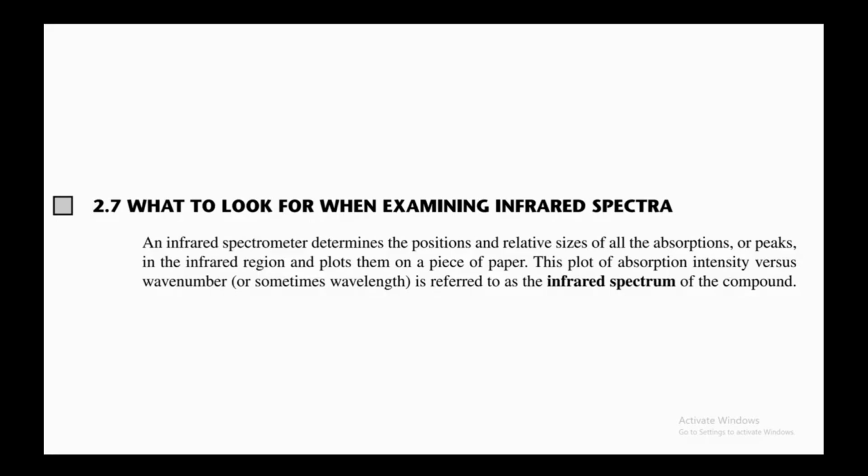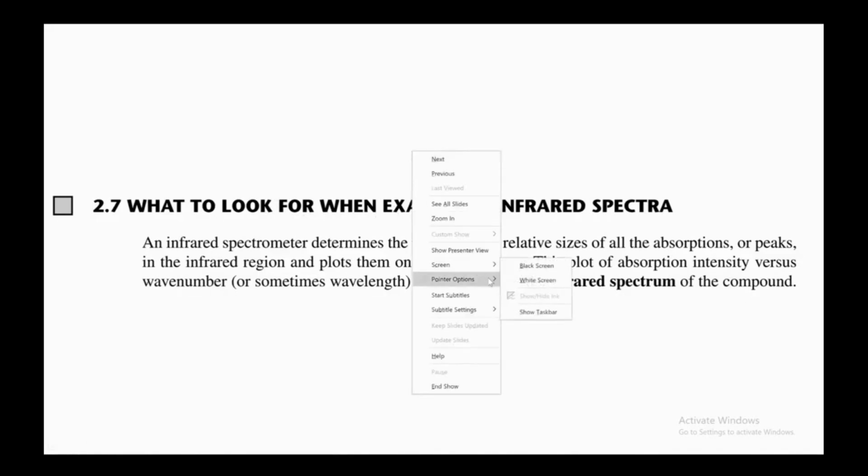Now we are going into more of an applying part, like what information we can get from IR spectroscopy and how to interpret the IR spectra. So what to look for when examining infrared spectra, that is the key question.